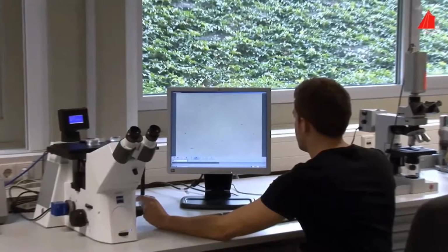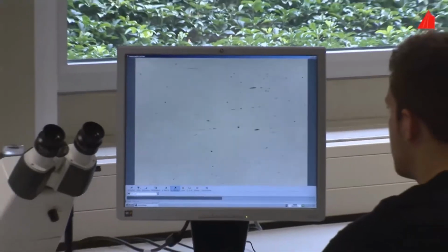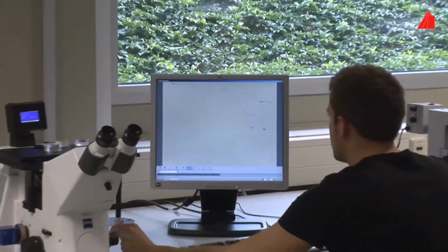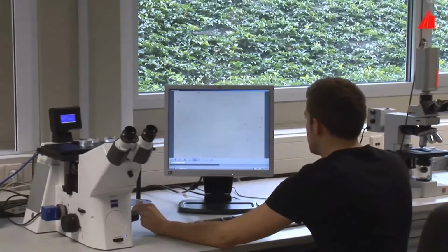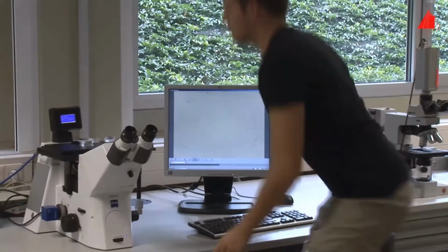Using the built-in digital camera, the polished specimen surface can be observed on the computer monitor. In the polished state, there isn't much to be seen in this material. Only some elongated non-metallic inclusions can be observed, but if these inclusions are of special interest, then the polished state is the perfect one. Inclusions may best be seen here. However, if one wants to see the crystals, the grains and grain boundaries, then the microsection has to be etched.